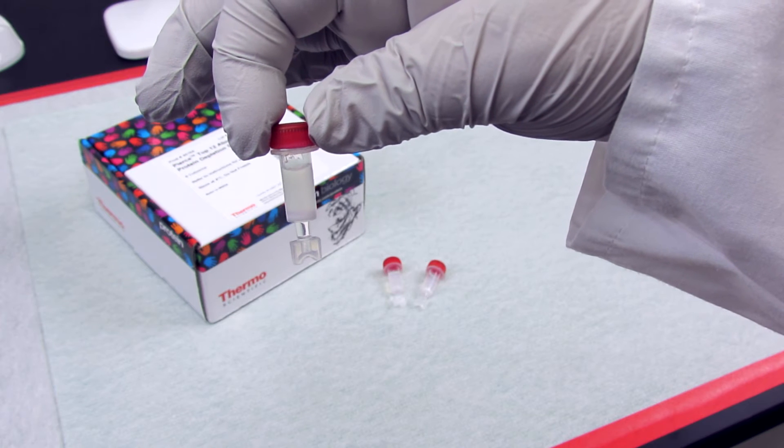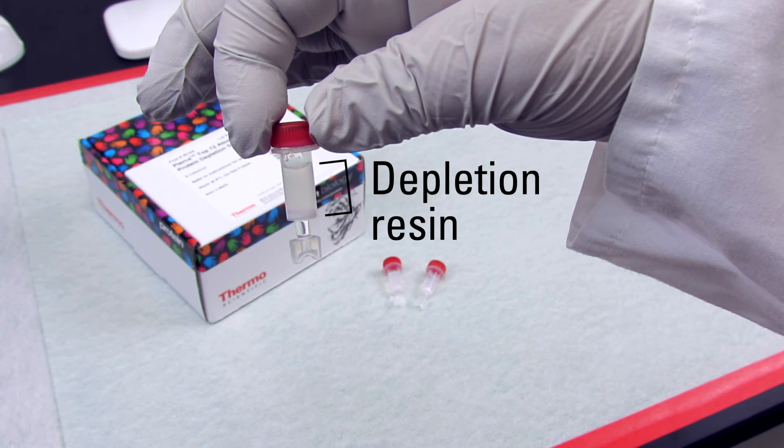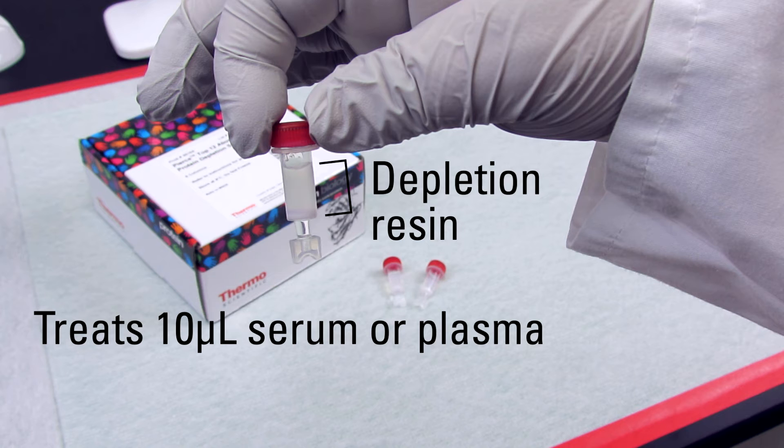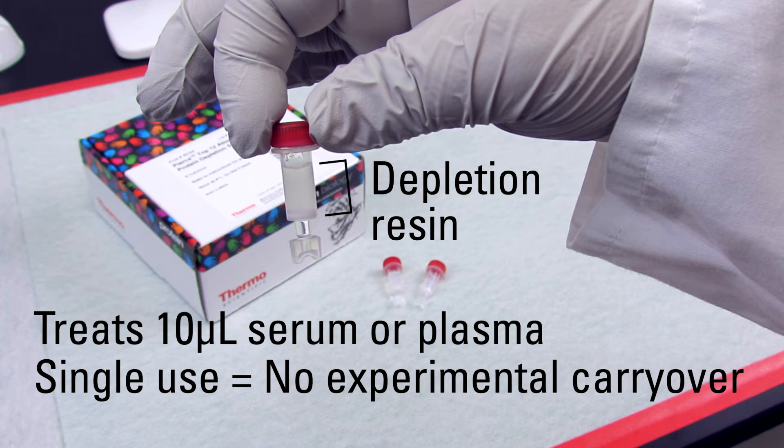Each spin column is pre-filled with sufficient resin to deplete abundant proteins in 10 microliters of serum or plasma. And because the columns are single-use, you don't have to worry about experimental variability caused by abundant protein carryover.